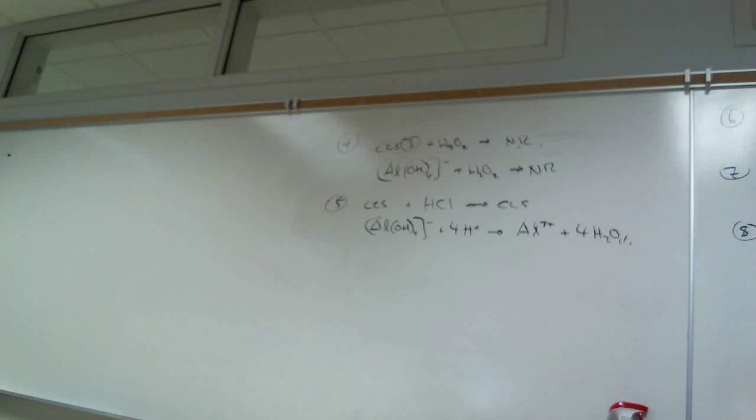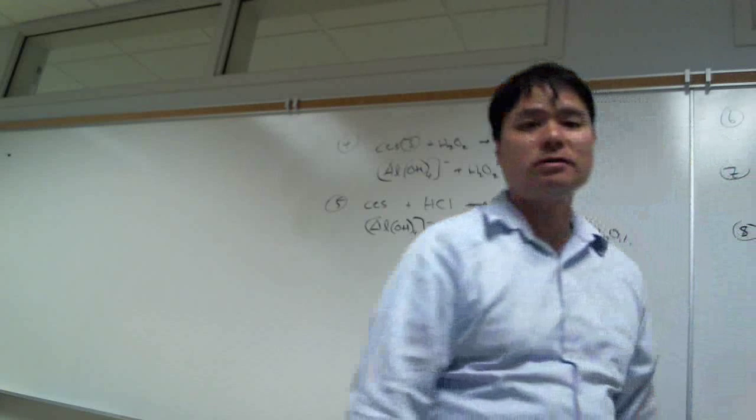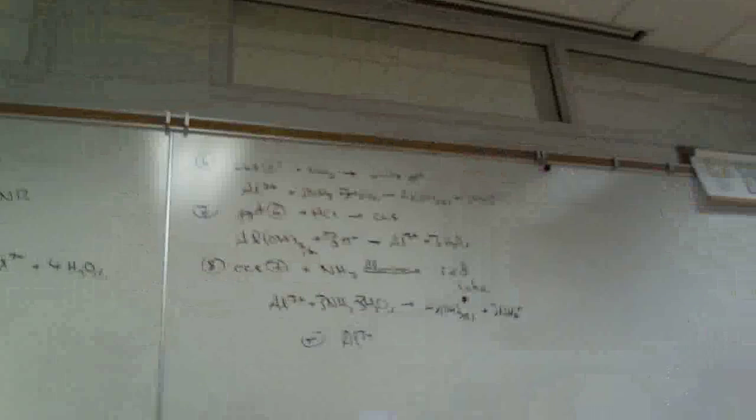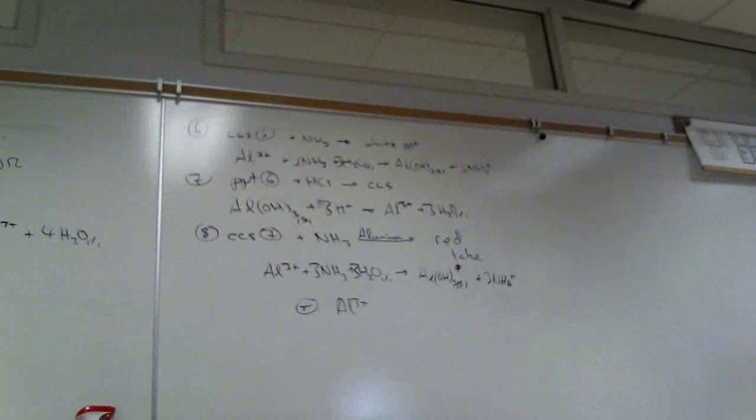So we go through all these steps and then we come out with positive, for the Al3 plus ion. And so this would be the test for aluminum. Okay, then we had the test for chromium next. So let's take a look at that.